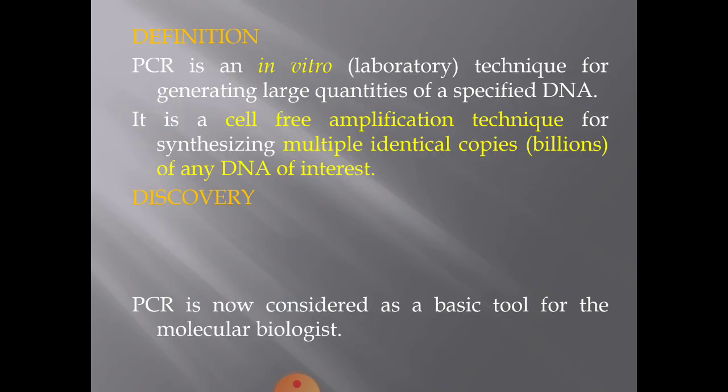It is just to have multiple copies of a specified piece of DNA. Something like xeroxing the material what you want multiple times, 100 copies, 1000 copies, like that. Here you will generate large quantities of specified DNA.